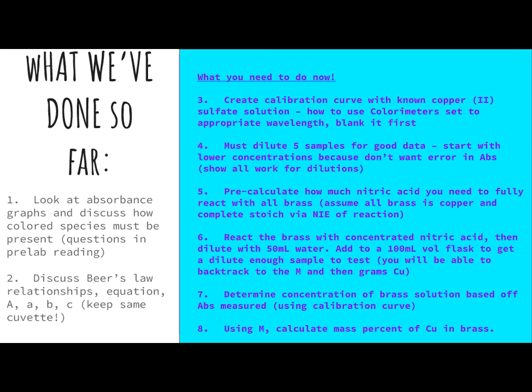What I would do is have one or 2 people starting dilutions. I have a couple out there already for you: 1 molar, 0.5 molar, and 0.4 molar. So I've got 3 of them. If you wish to use those, you need to get 2 more dilutions in. They are dispersed around the lab. So make sure you're showing your concentration. Show me your dilution equation, how you're going to find these concentrations.